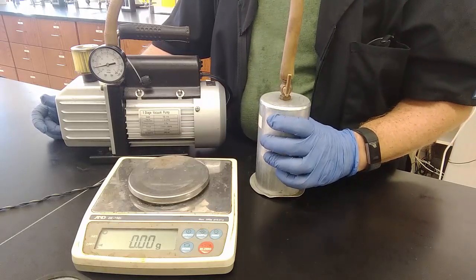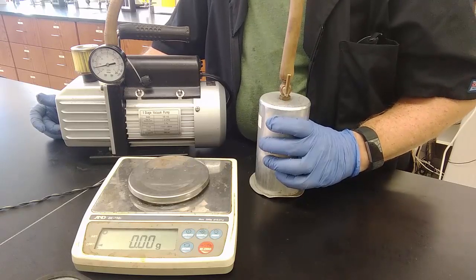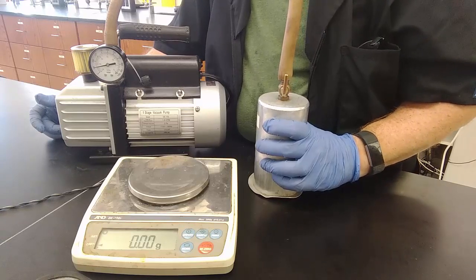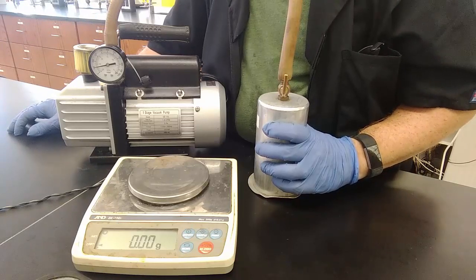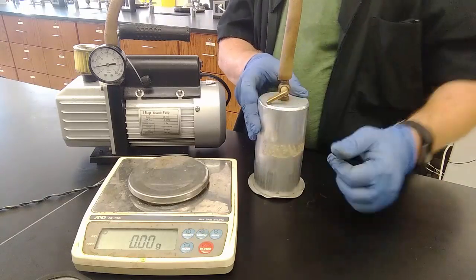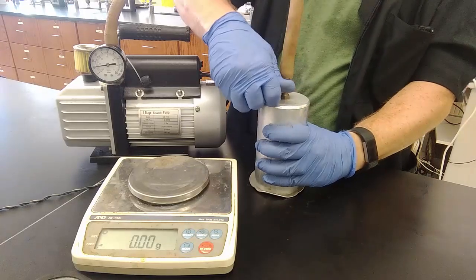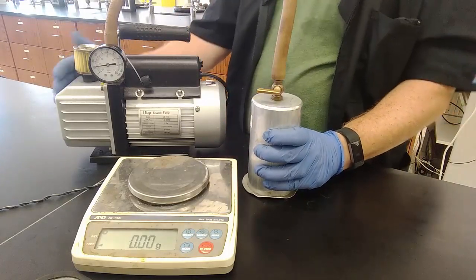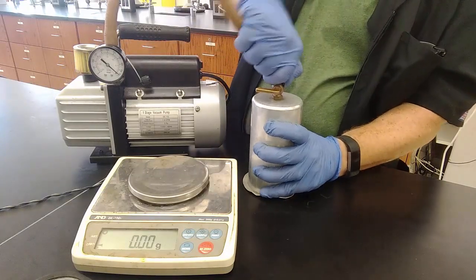Alright, so we're doing step 2, opening the valve, attaching the hose from the vacuum pump, and we're evacuating it for a couple of minutes. Step 3, when the pressure gauge has stopped moving, even if it's broken and not reading total vacuum, we will close the valve. Right, handle is sideways, so that means the hole is perpendicular to the hose, and no air can go back into the densitometer. We will turn off the densitometer, and we will remove our hose.